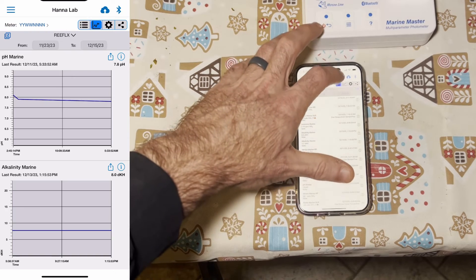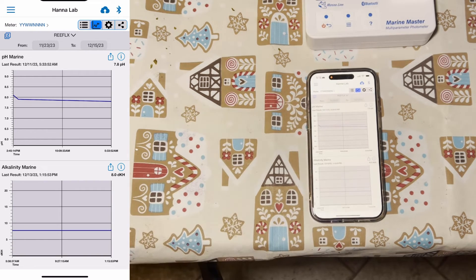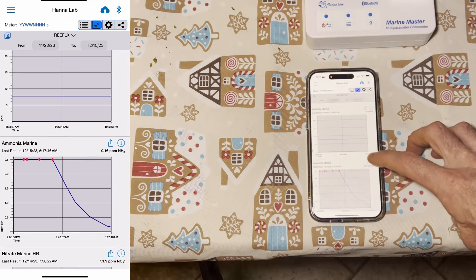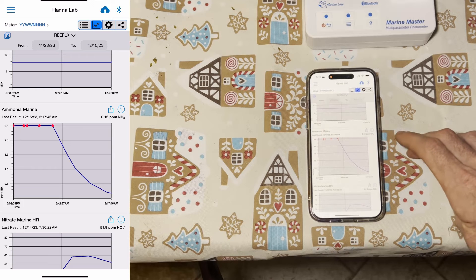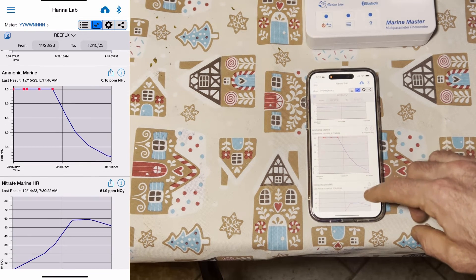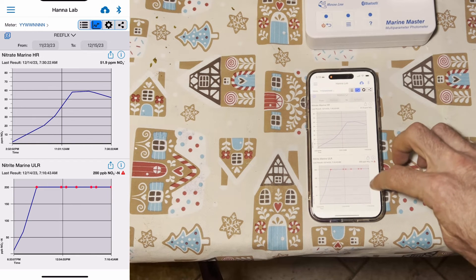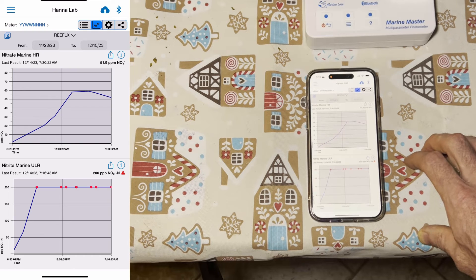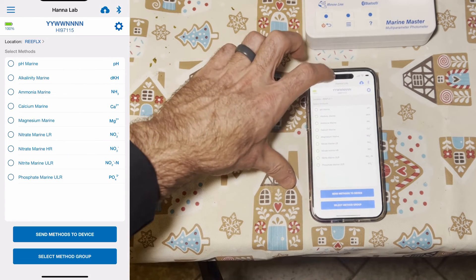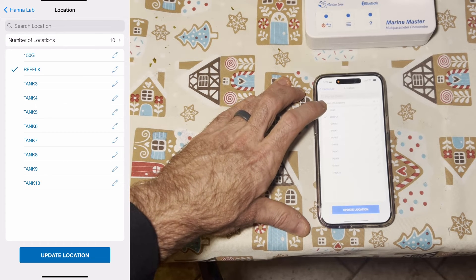Here you can see some of the additional tests that I've done. It stores all of your prior tests in a graph-like format. You can see where my ammonia started off at around 2.5, and then eventually as the tank cycled, it started to creep down to where it is today. Scrolling down more, we can see my nitrate and nitrite results. My nitrite has been steady up around 200 parts per billion, but the tank is still cycling. It also has the ability to support up to 10 different tanks — it's set for my Reeffelex right now, but I've also done tests on my 150 gallon system as well.